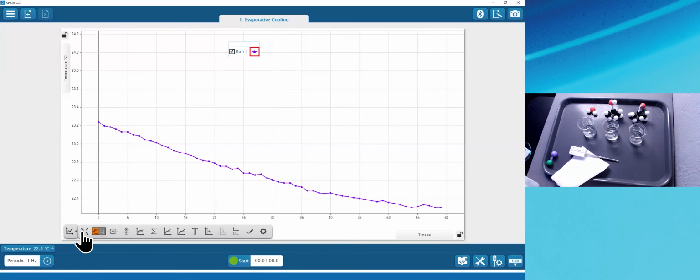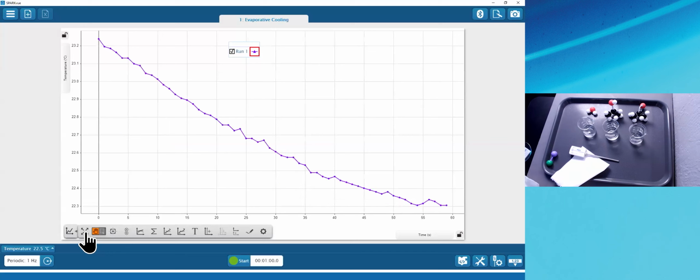Students can open up the toolbar and use the auto scale button so they see the whole data, and this follows the rules that we teach students about graphing. You would have taught students those graphing directions: always put a title. Use an appropriate range for your data on both y-axis and x-axis. Increase at regular intervals. Put a label with units when units are part of your measurement on your x and y-axis. So all the rules. Use a legend, all of them.